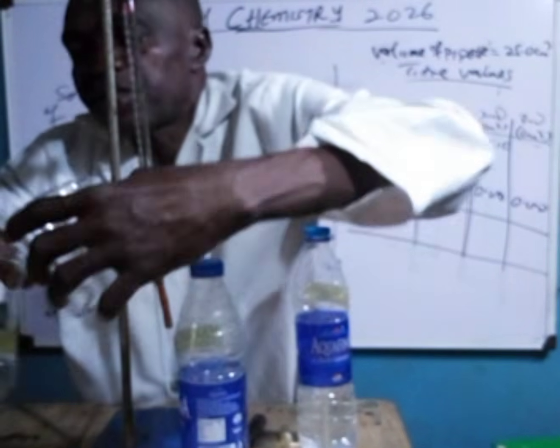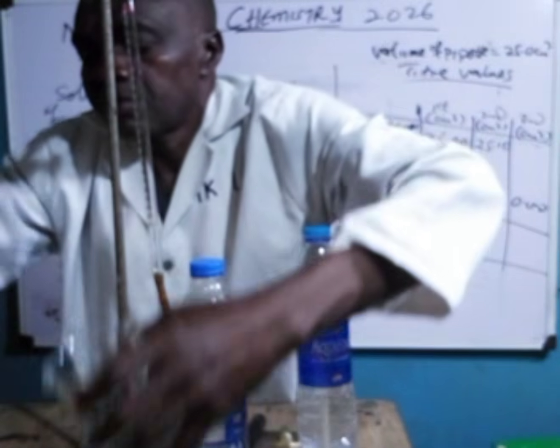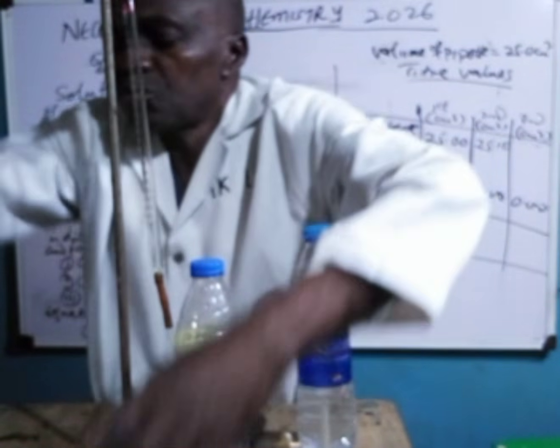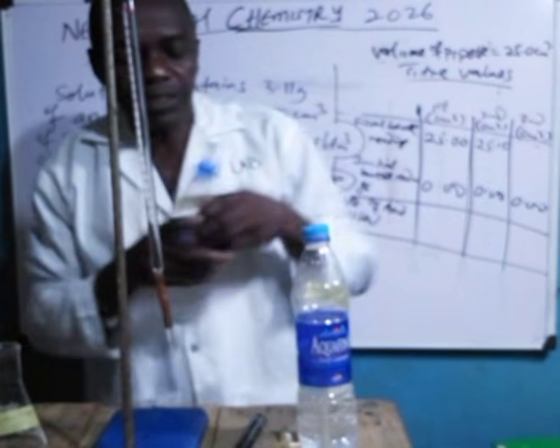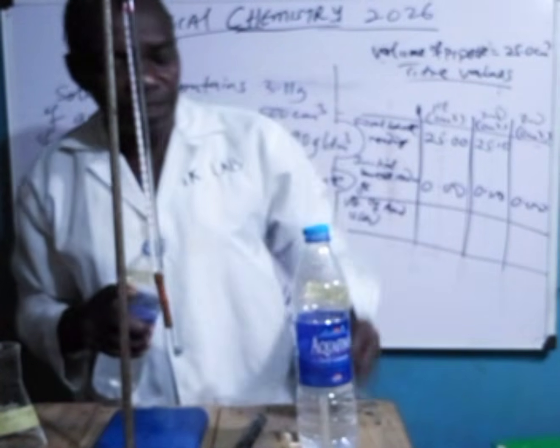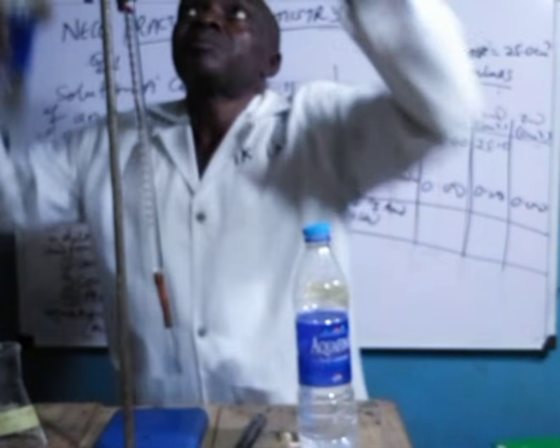Rinse again with clean water. Ensure you don't make unnecessary errors when carrying out this work. So let's refill the burette.